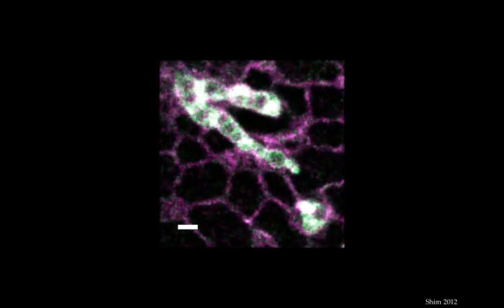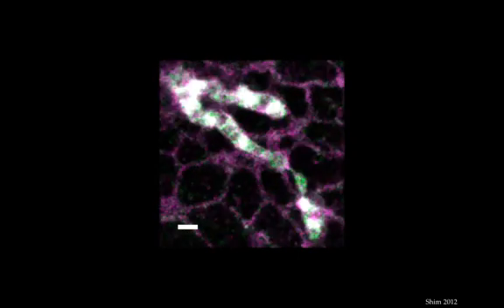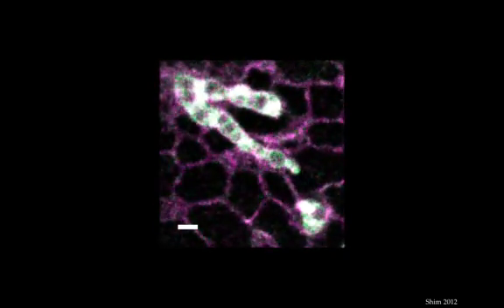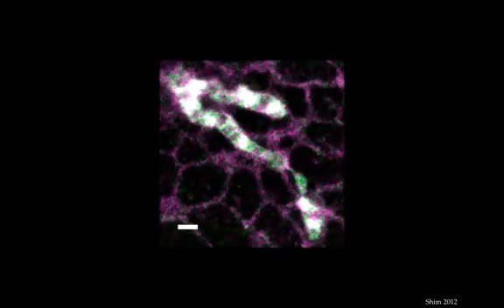We can also use two-color imaging in live cells to look at interactions between structures. Shim here studied mitochondria and ER connections. They were able to observe that ER tubules were often co-located with mitochondrial fusion, fission, or constriction sites. Of course, there's also a lot of other applications. Besides looking at organelles, we can look at individual biomolecules or complexes. So clathrin-coated pits were initially used as a test of the ability of STORM to accurately resolve biomolecular complexes.